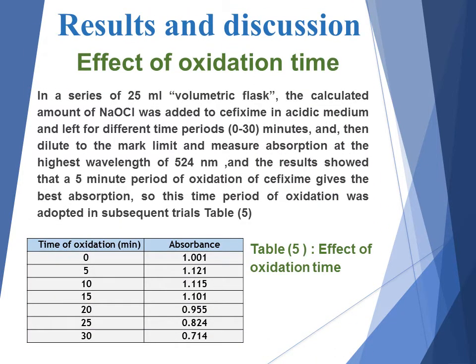Effect of oxidation time. In a series of 25 ml volumetric flasks, the calculated amount of sodium hypochlorite was added to cefixime in an acidic medium and left for different time periods from 0 to 30 minutes, then diluted to the mark, and absorption was measured at the highest wavelength of 524 nanometer.